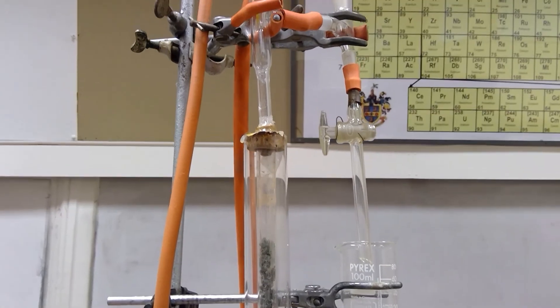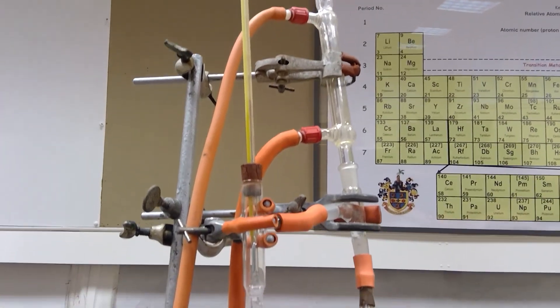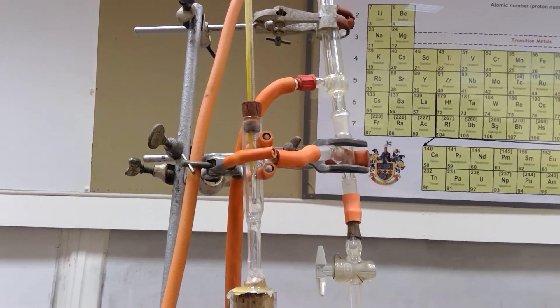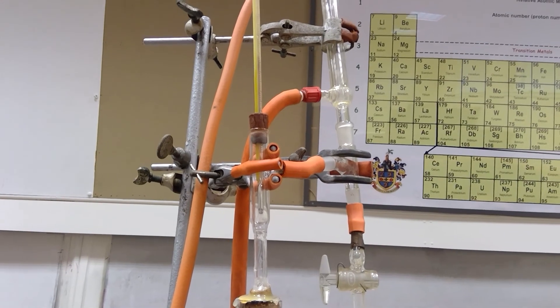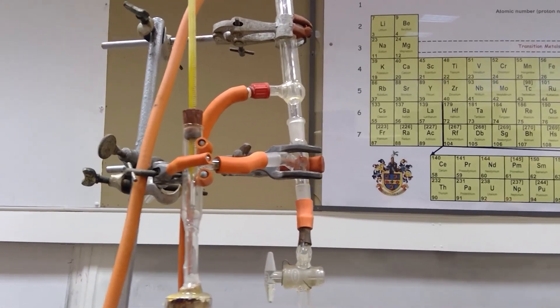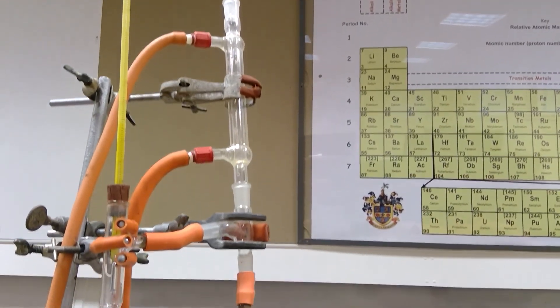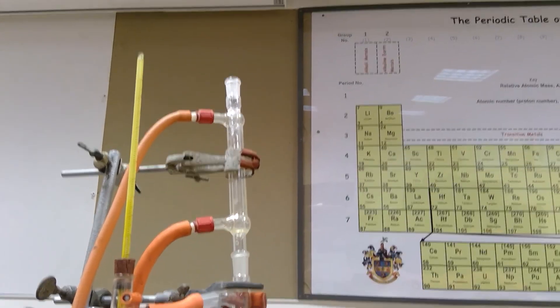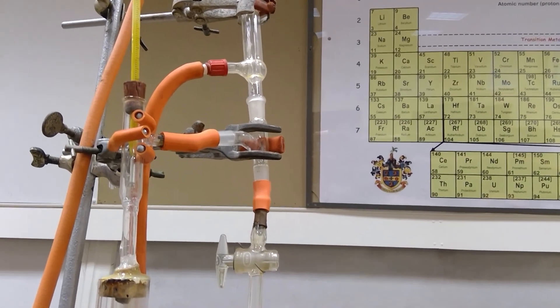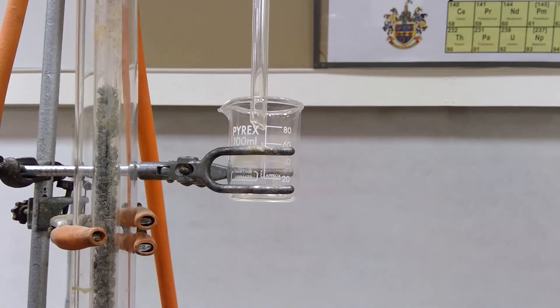Moving further up the column, you can see that we've got a mercury thermometer, just to track the temperature. The key temperature we're looking out for is 79 degrees Celsius, which is the boiling point of ethanol. The boiling point of water of course is 100 degrees Celsius. And then if you follow that orange tube to the right, you can see a smaller condenser, which just ensures that there will be no pressure build-up of gas in the apparatus. Hopefully the ethanol that we make will drip down past this tap and collect in this beaker.